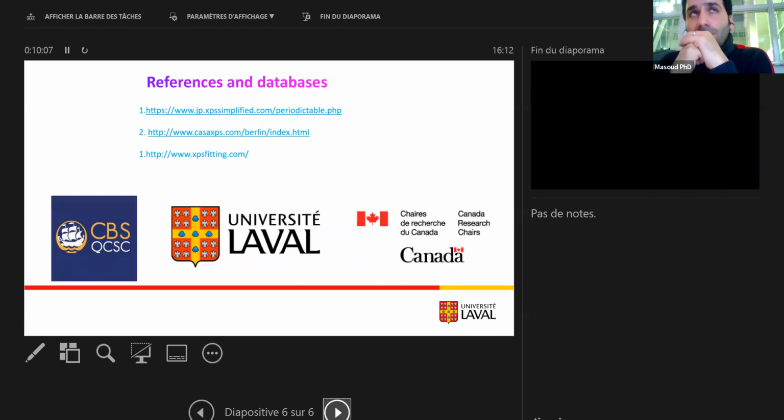There are a bunch of databases and literature on the internet, but the XPS Simplified website that belongs to Thermo Fisher, and also XPS Fitting from Western University, are quite reliable, and a lot of useful information related to different types of materials is present on these websites.